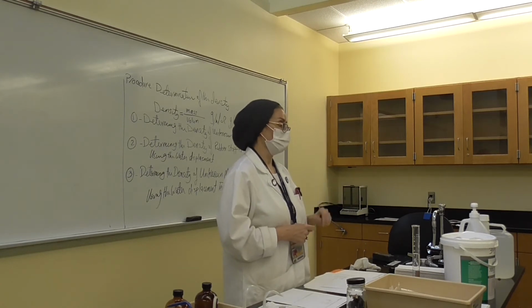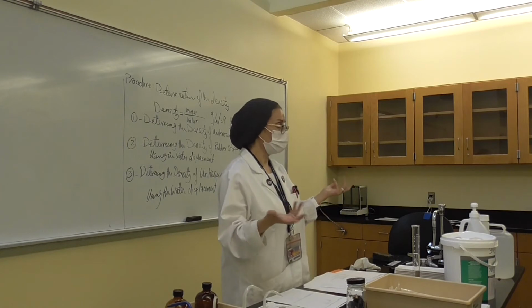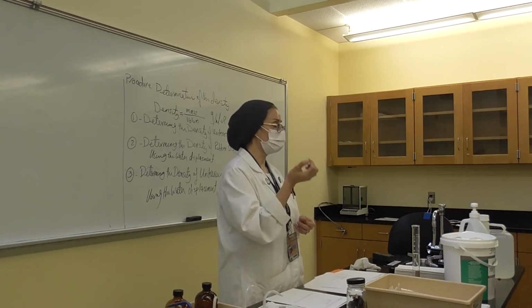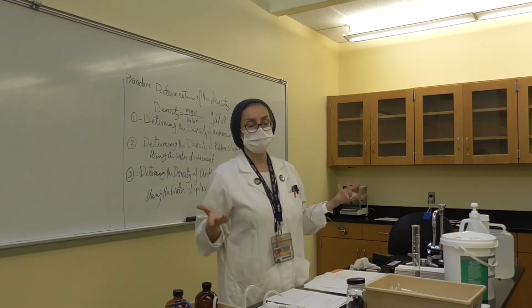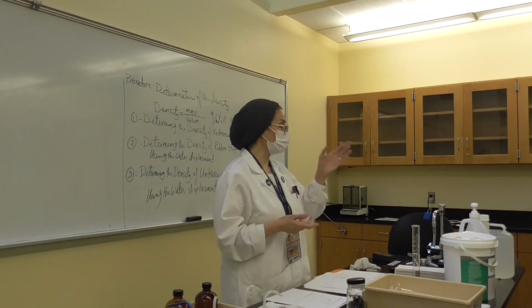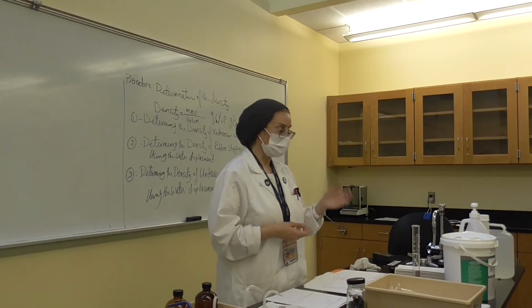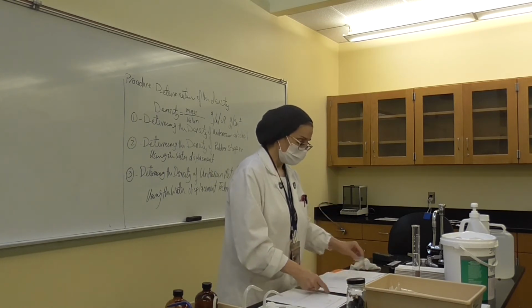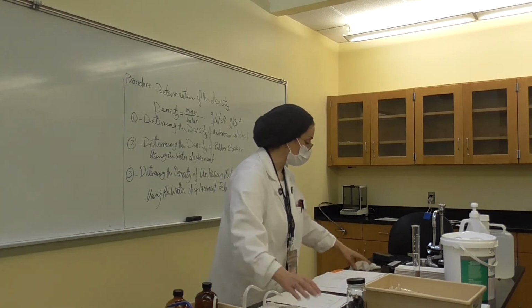Now from the weight, that's a molecular weight. It's not the weight that we're going to measure. But remember when we talked about the density, that it is an identity? It's like we identify any substance. The first thing you're going to see in any of those chemical and physics handouts is the density. One of the identifications of any substance found or any element found in nature, okay? Or even prepared or synthesized. So this is basically what we are going to do today.